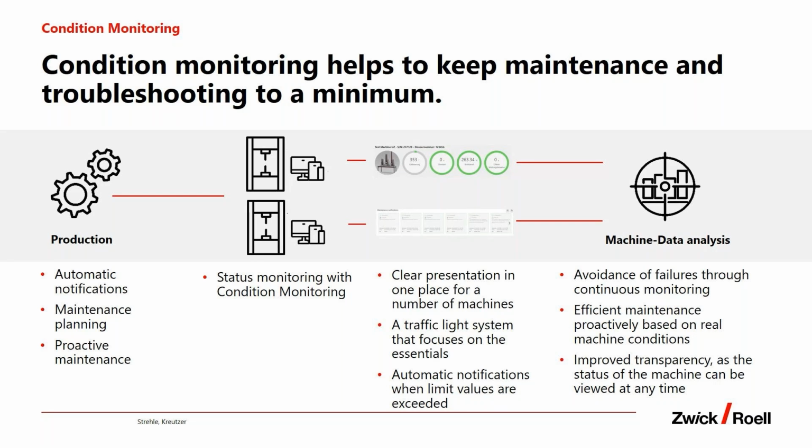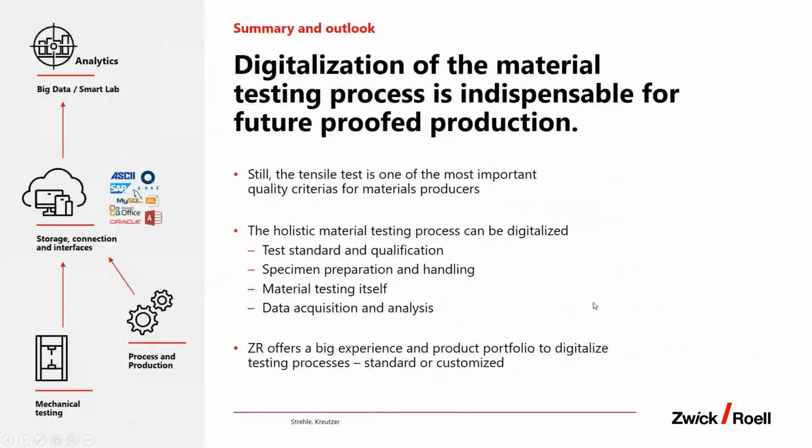So let's move to another example. This was already our example. This is giving you a summary before we give you a short live demo of these applications. This digitalization of your material testing process is part of the future for your production. We are all talking about big data.